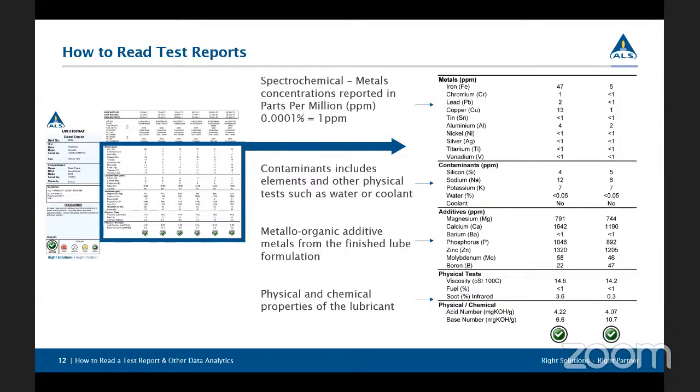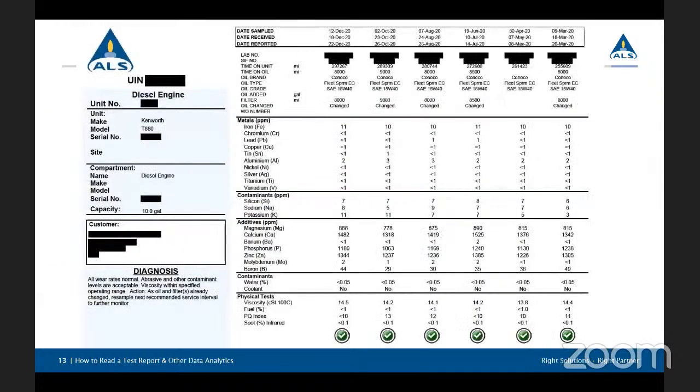Now we're going to get into some real reports. These are actual live reports from customers. I've scrubbed all the identifying information from them, but it's important to look at real reports, not something that's been made up, fake. I think it's really important to look at what's really going on with people out there that are doing oil analysis. And this is a pretty good example.